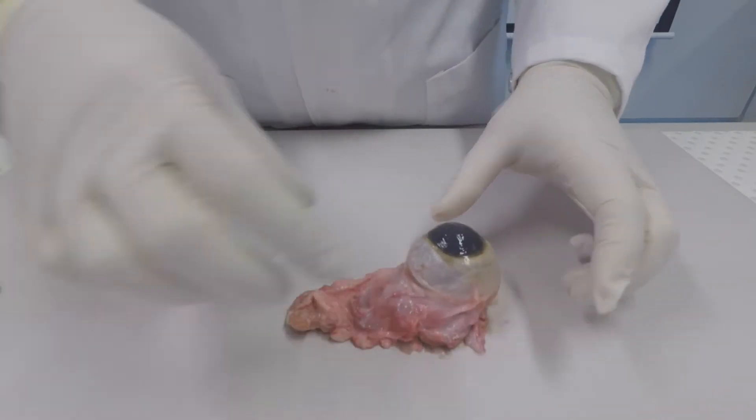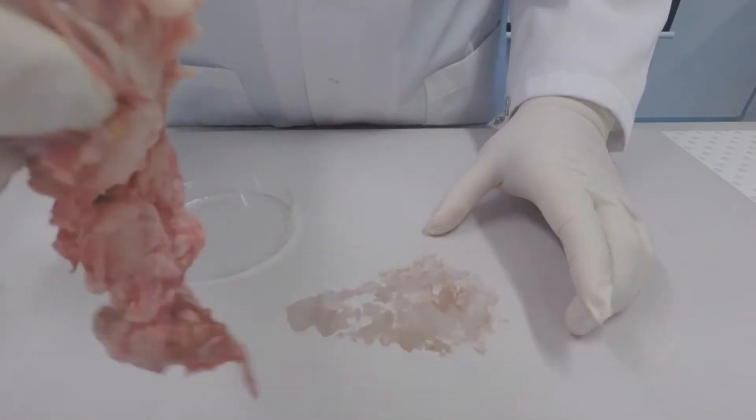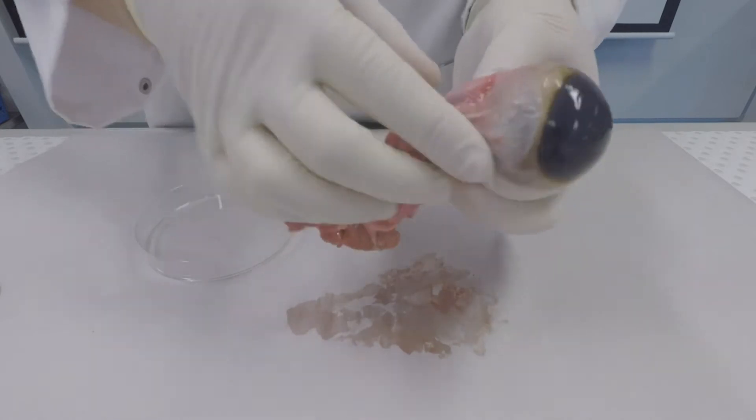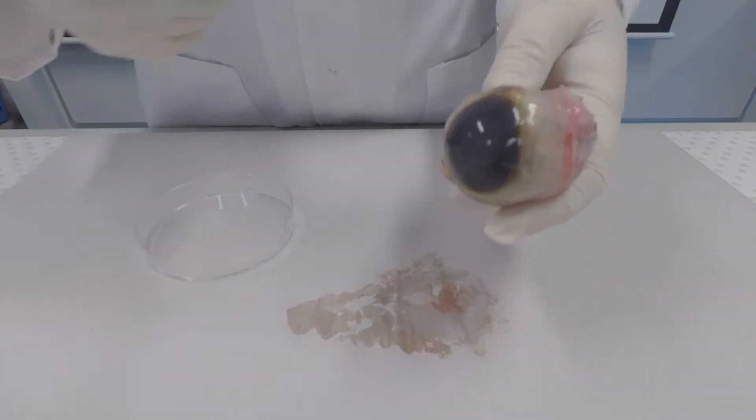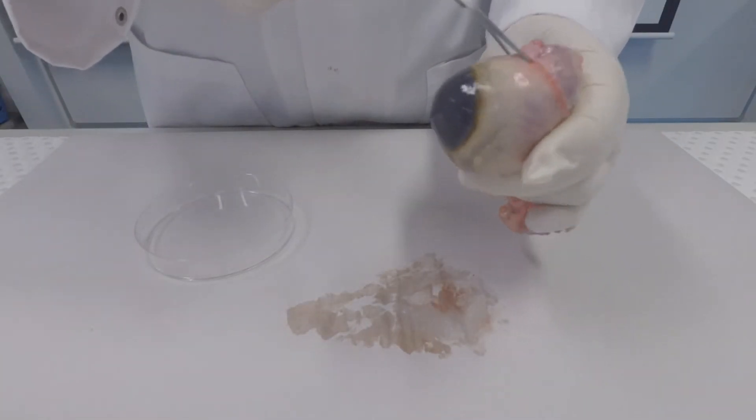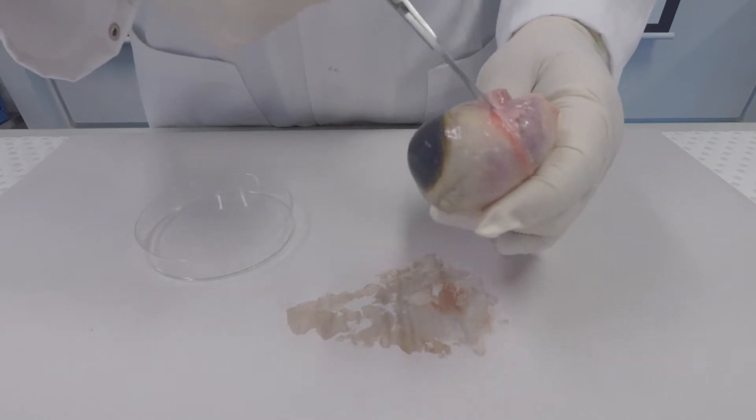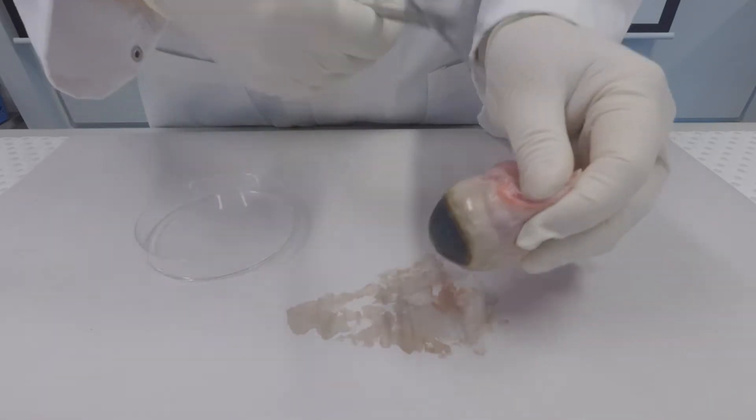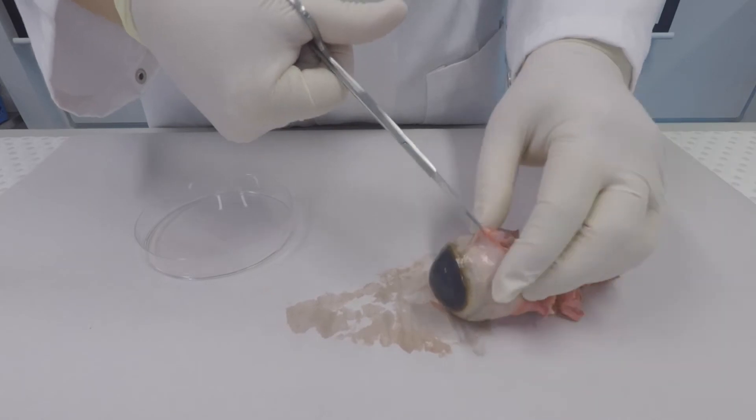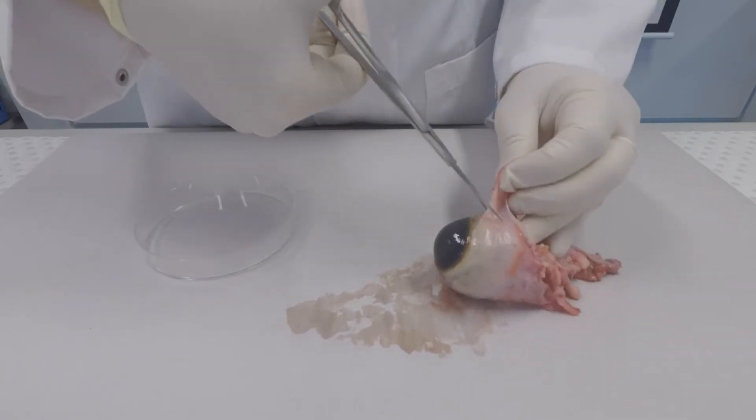The outer portion of the eyeball is called the sclera. It's very tough as you can tell. The front portion of the eye is called the cornea, and that is the part that is exposed to the environment.